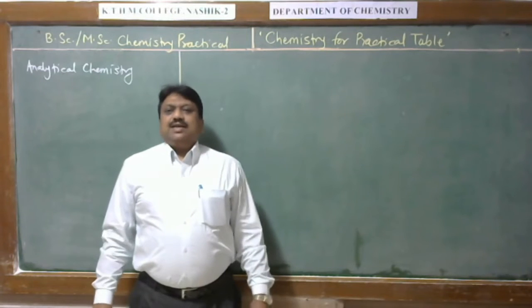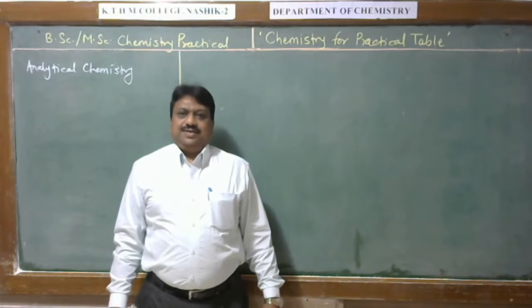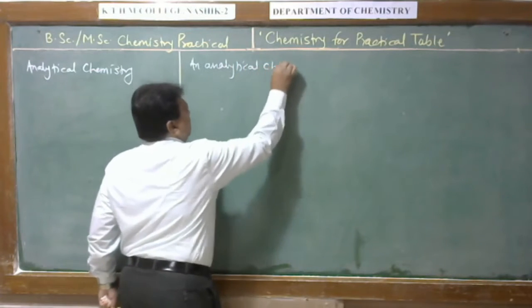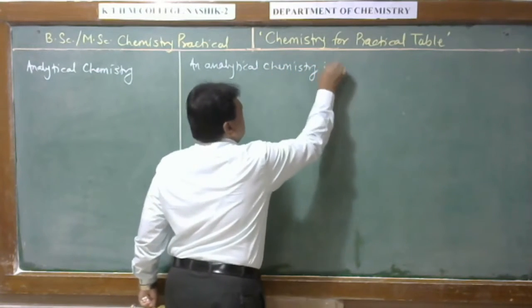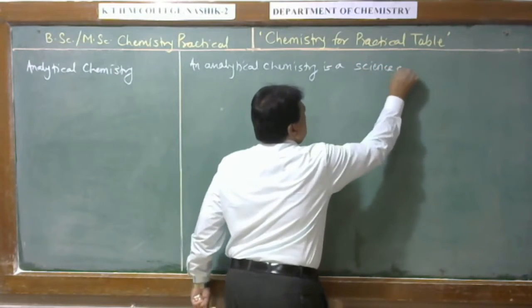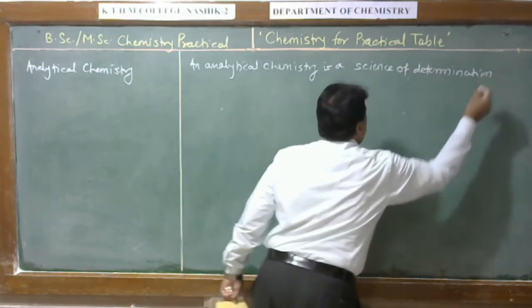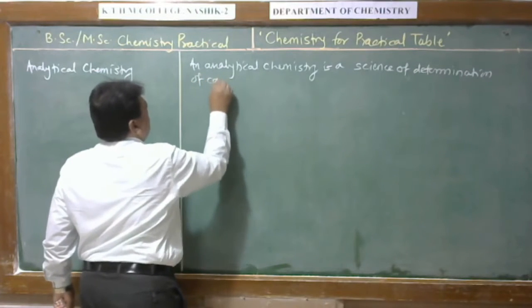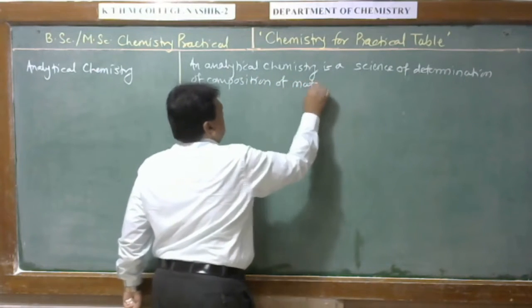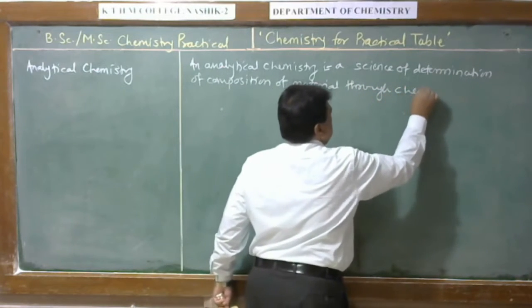Student, we know that analytical chemistry is a science of determination of composition of material through chemical analysis.